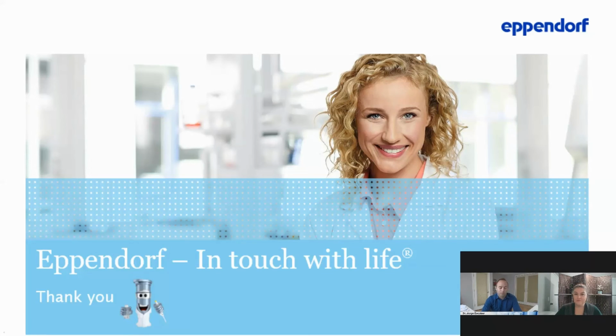All right. Thank you for that. Have you ever tried any other pre-culture expansion protocol other than T-flask expansion? This is a really good question. This is an ongoing study right now. Rather than trying to expand the cells in 2D, we are right now trying to expand the cells in 3D using the aggregates in flasks. And I think that we can save time and we can have more cells for the inoculation process.